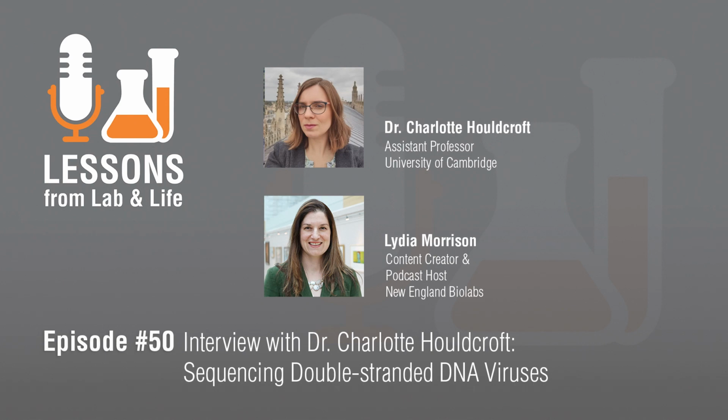Sequencing really has transformed virology for everyone, but I've loved virus sequencing since I did my PhD in 2009. I started my PhD as the swine flu pandemic was rolling through the UK. And back then, sequencing, it was all Illumina, it was much shorter read, and it would take weeks and weeks to get virus sequenced back, even from a pandemic pathogen like swine flu.